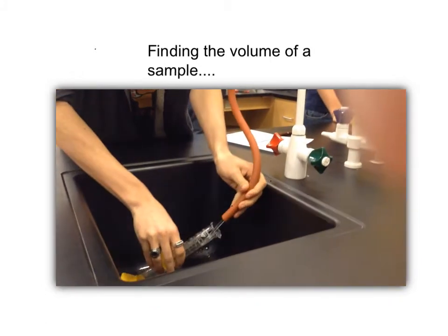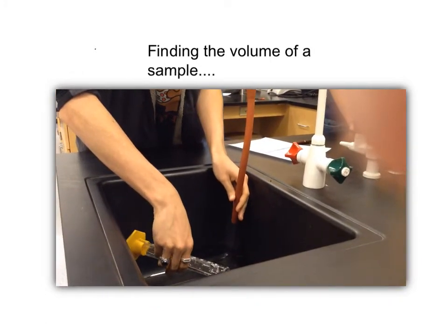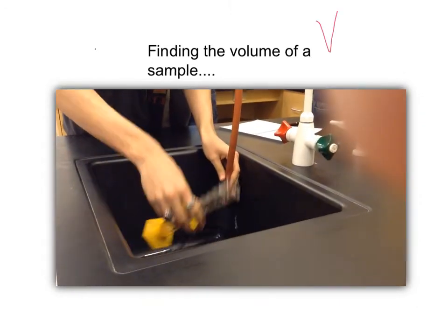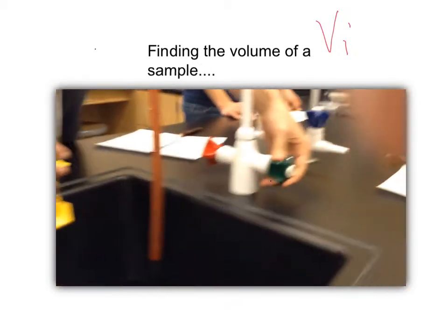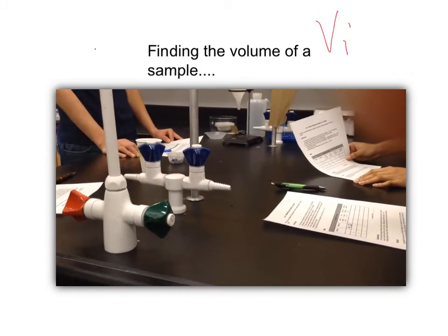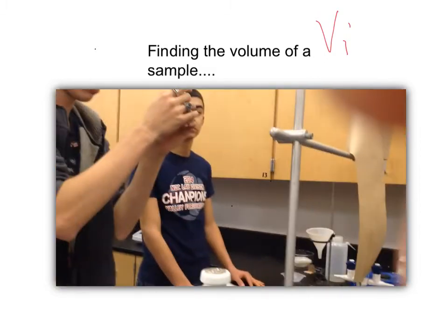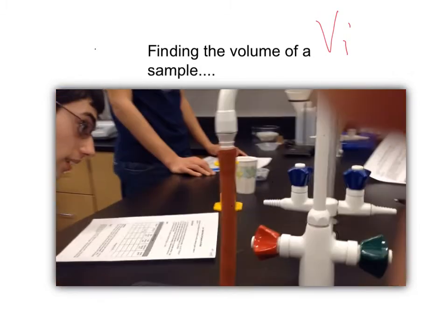Here's how we find the volume of a sample. We add water to a graduated cylinder, and we write down the initial volume. We add the entire sample to the water.